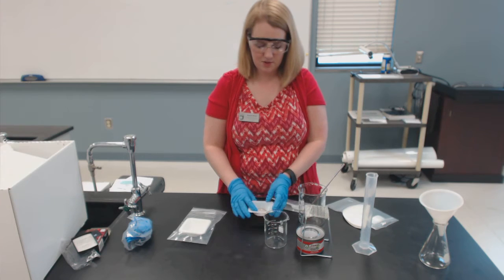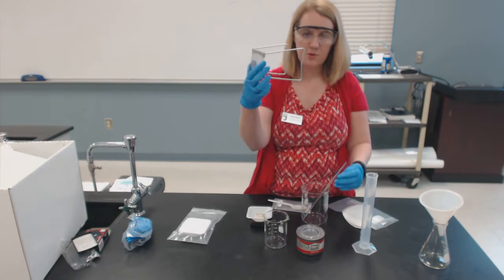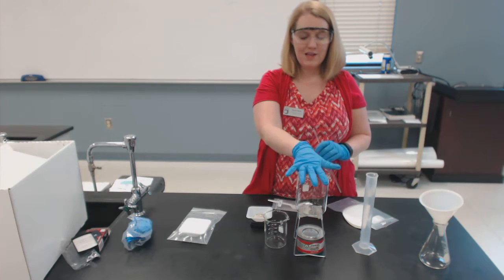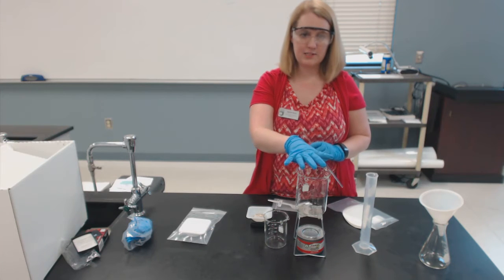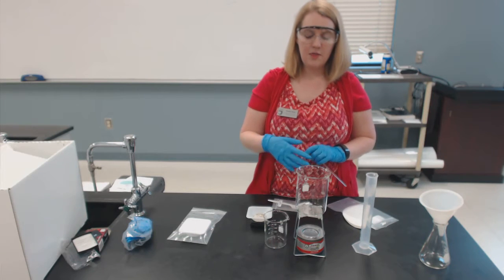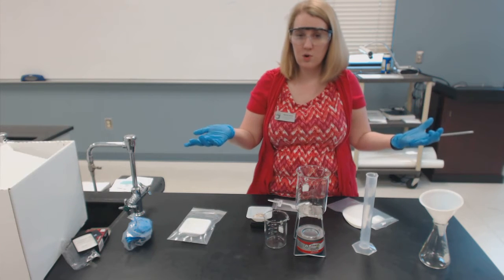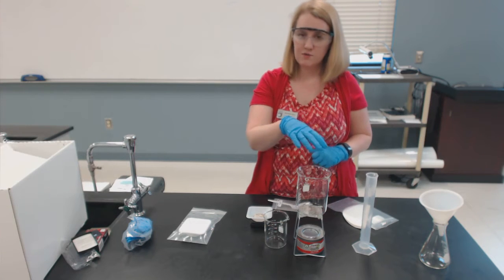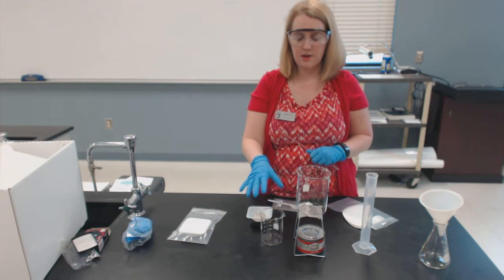Some safety notes, though. We'll be working with heating up glass. So on top of your sterno, we have a support, have glass beakers to heat them up. When the glass is hot, of course, use your tongs or your insulated glove to move the glassware. But make sure once the glass is hot, you don't let it come into contact with anything cold. That means if you heat it up for some reason and then later decide that you want to add cold water, don't add cold water to the hot glass because it will cause it to shatter. Transfer your mixture to some other container, another beaker, and then add cold water to that.